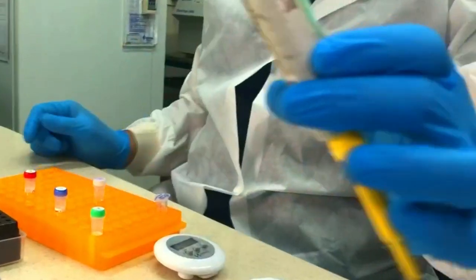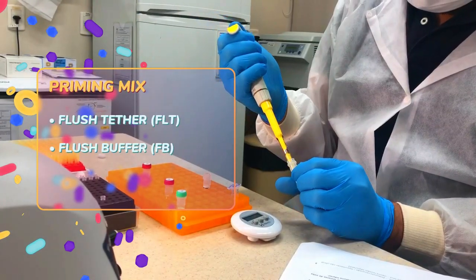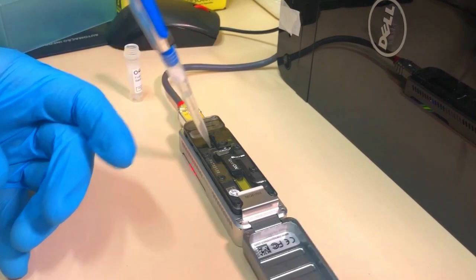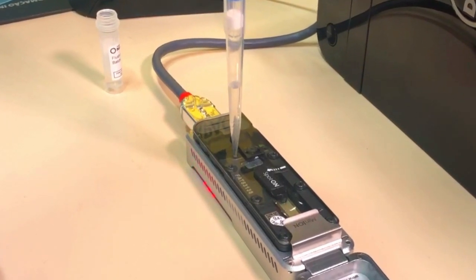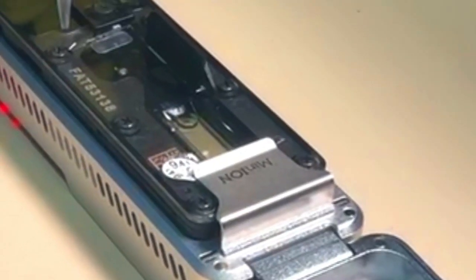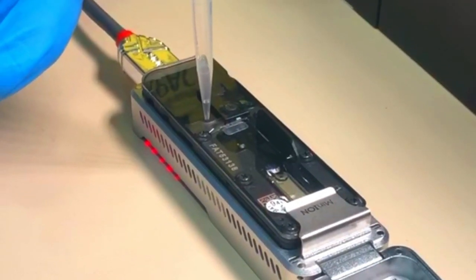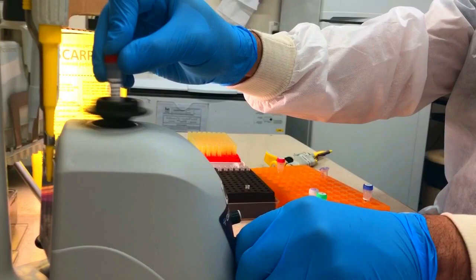The very last step is to prepare the MinION device to receive the library. To do that, you need to prime the flow cell and prepare the library mix. To prepare the flow cell priming mix, add 30 microliters of the flush tether (FLT) to 1.17 milliliters of flush buffer (FPB). Load 800 microliters of the priming mix into the flow cell via the priming port and incubate for 5 minutes. Then load 200 microliters of the priming mix into the flow cell via the priming port, this time with the spot-on port open.